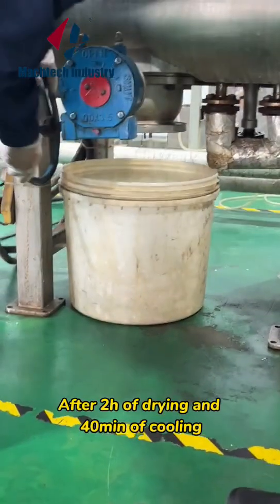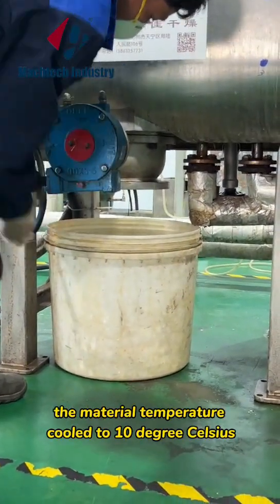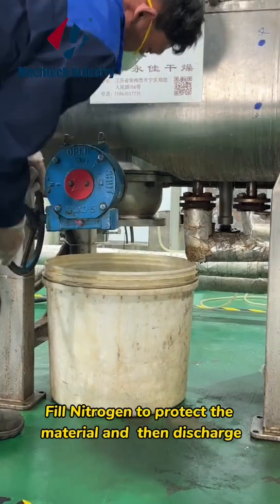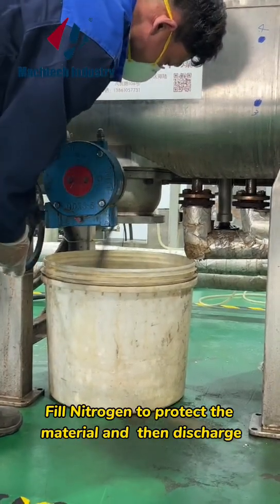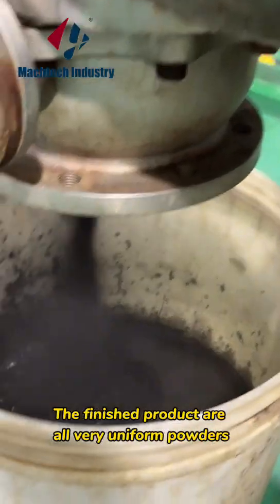Material starts to boil. After 2 hours of drying and 40 minutes of cooling, the material temperature cooled to 10 degrees Celsius. Fill nitrogen to protect the material and then discharge. The finished products are all very uniform powders.